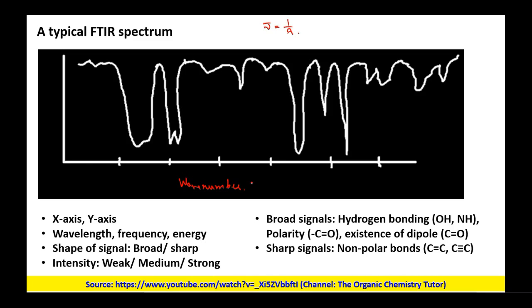Lambda may be in meters, it may be in centimeters, and so on. Here we have wave number in centimeter inverse. Now, what is the y-axis?